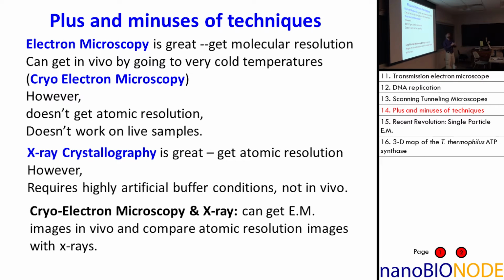And you also always try to go to minimum of exposure. Another alternative is you go to very low temperatures, like liquid helium or liquid nitrogen. And at that temperature, things tend to be very still, and their interaction with electrons, while still there, tend not to be quite as damaging.